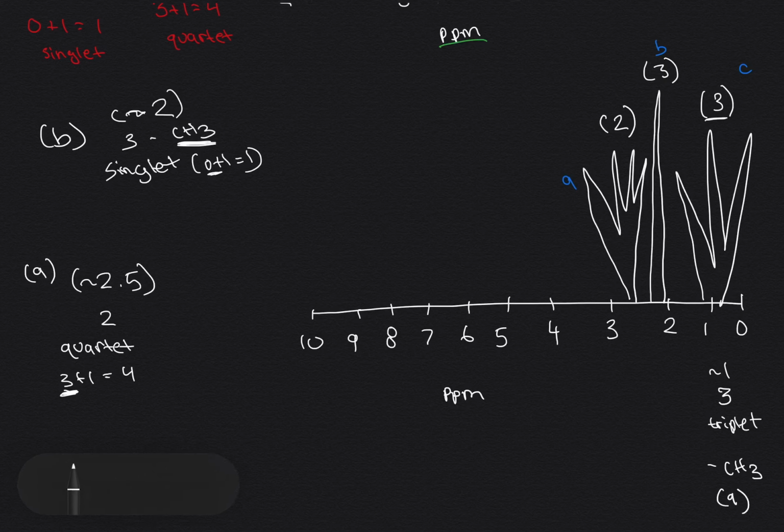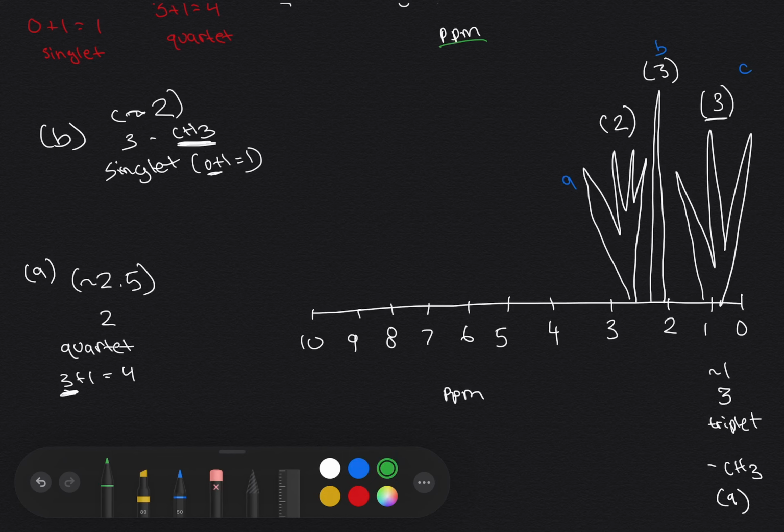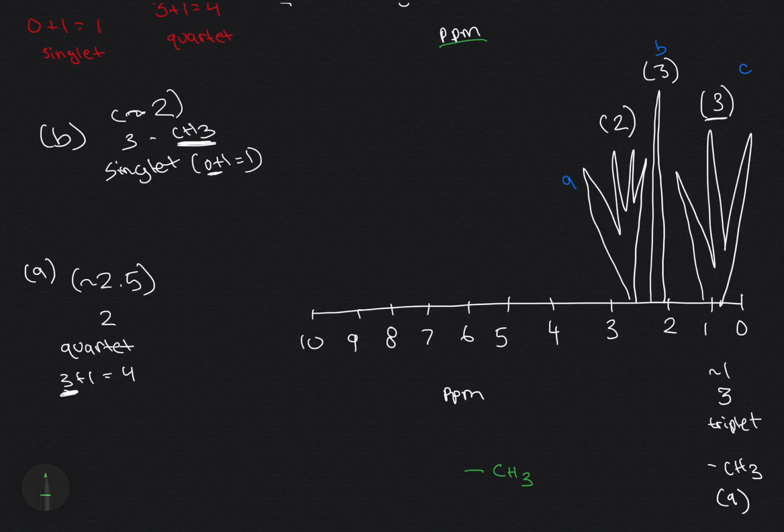So let's go ahead and start trying to draw this molecule. So we have CH3 at one end here. We know we have another CH3, and that has to be at the other end if there's another CH3. You could do something like that. And now, okay, let's focus on the signal B over here. Let's just say this one was B. So we know it's a singlet, so it's not next to any hydrogens. So what could that be?